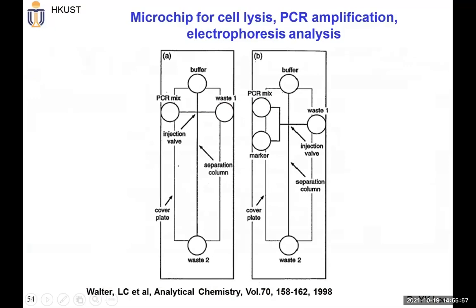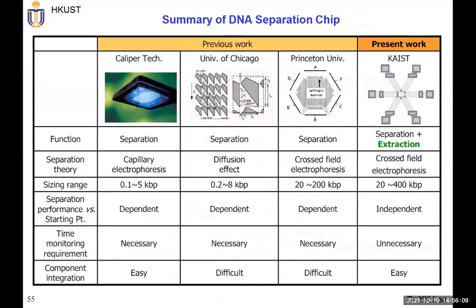So from the proof of concept device for this kind of microfluidic device to making a real product, it still takes time, but that is something that can finally ship, right? Of course, I already showed you about this in the research field. Many people try many different kinds of device design, right?